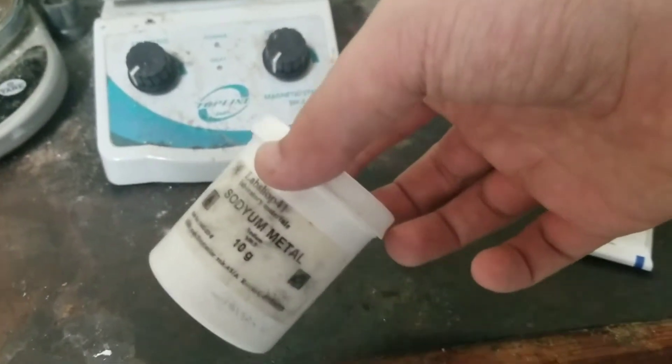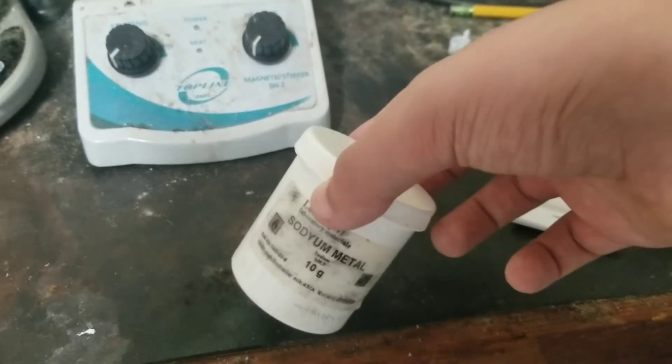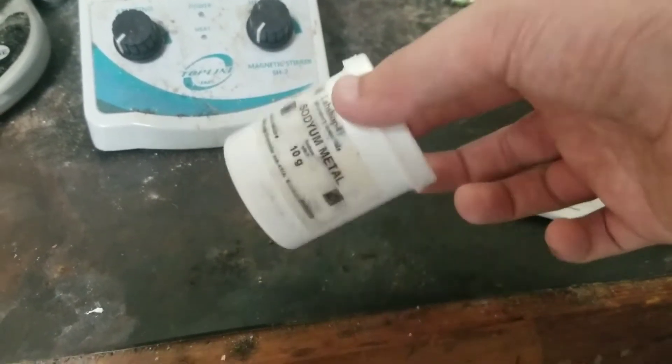We're just going to take this and burn it in air. I would put it in water, but that experiment has been done so many times on YouTube there's no point — you can just look it up.